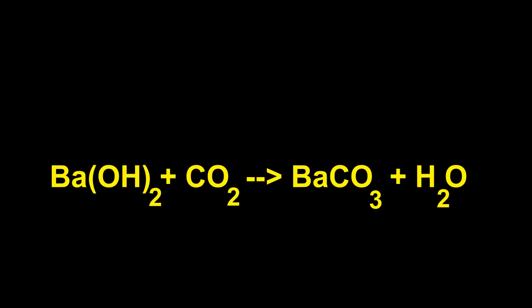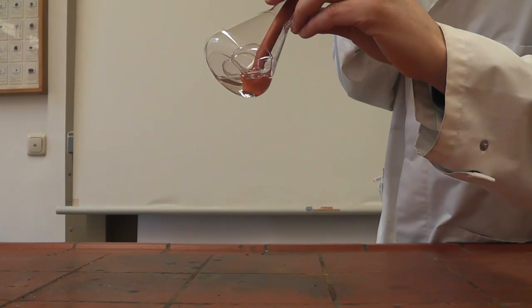You can use barium hydroxide solution as a test for carbon dioxide. This will form barium carbonate, which is insoluble and turns the liquid cloudy. Here I just blew into it. It shows I am exhaling carbon dioxide.